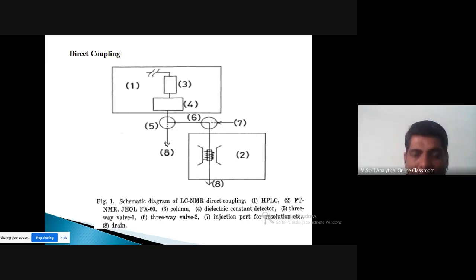आता ज्यावेळेस तुम्हाला वाटतं आपल्याला सॅम्पल कंटिन्युअसली येत राहणार आहे, वन बाय वन, विदाउट एनी स्टॉप, पण तुम्हाला वाटतं आता ही सॅम्पल घ्यावी, ज्यावेळेस सॅम्पलचं कॉन्सन्ट्रेशन जास्त असेल. सुरुवातीला थोडं कॉन्सन्ट्रेशन कमी असेल, थोडं पास झालं की कॉन्सन्ट्रेशन वाढेल आणि एकदा जास्त झाल्यावर नंतर थोडं थोडं कमी होत जाईल, कारण एचपीएलसी मधून सॅम्पल एकदम सर्व येणार नाही.